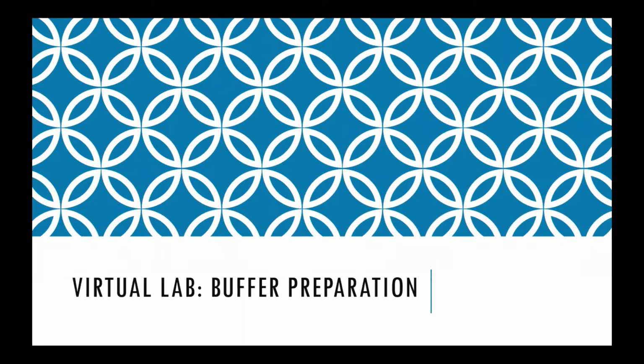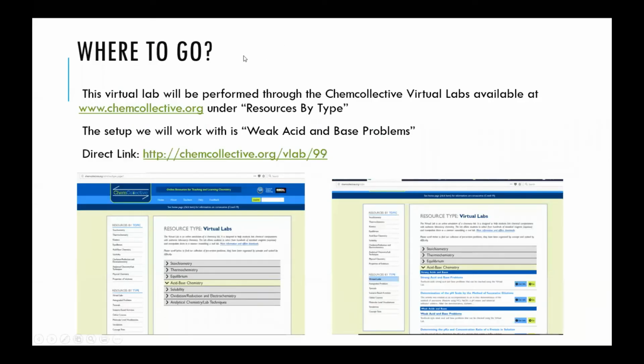So in this virtual experiment, you're going to be measuring the pH of a number of different compounds. You're going to be preparing and testing different buffer solutions, and performing a titration of phosphoric acid and sodium hydroxide. When you go through this Chem Collective website, you'll go to the virtual lab in the acid-base chemistry, and you're looking at the weak acid and base problems.